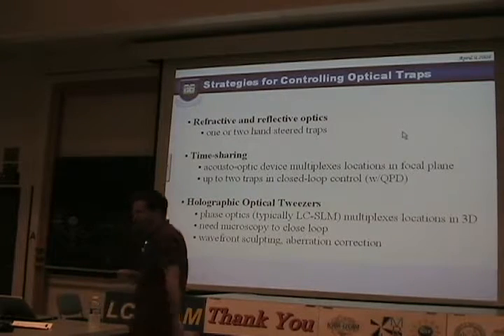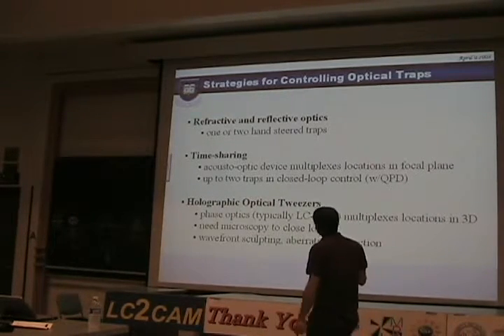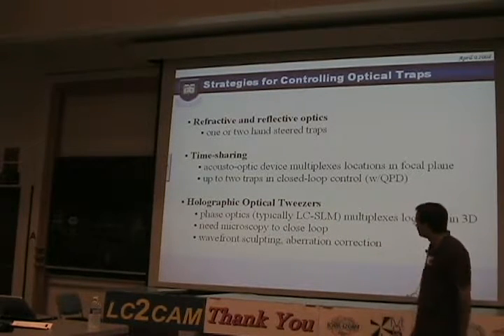All right. Okay, great. So for this sort of manipulation, you can really only make multiple traps in a single plane.